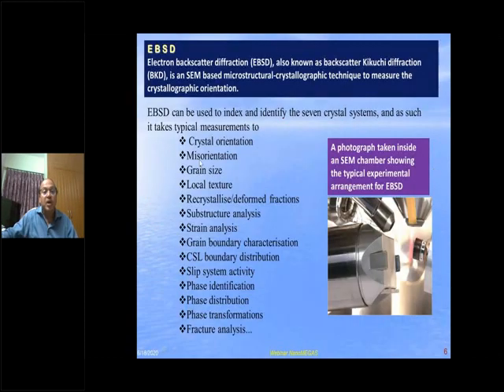So basically, what you can do in the next stage is EBSD, what we regularly do. That is electron backscatter diffraction. In the SEM chamber there is an electron beam, and we tilt our sample to 70 degrees to generate a Kikuchi pattern.